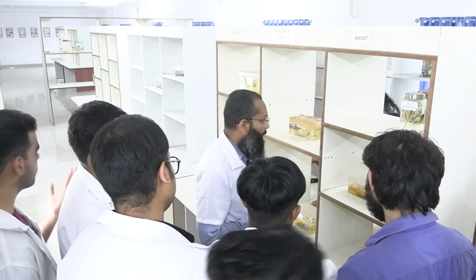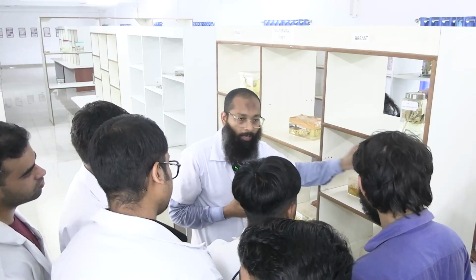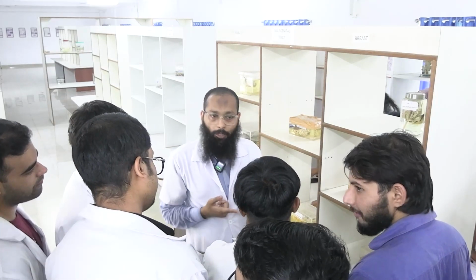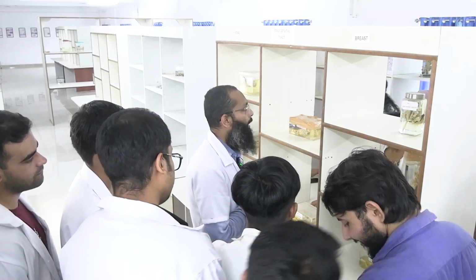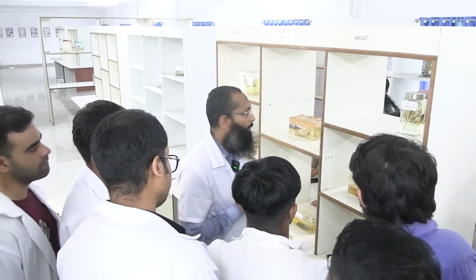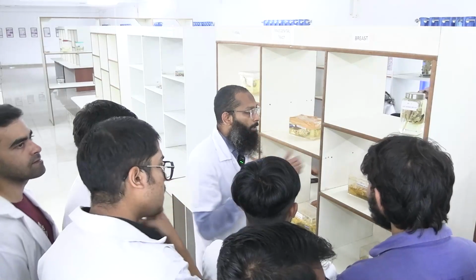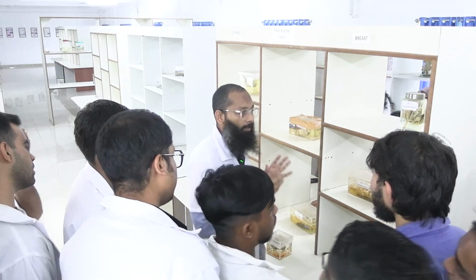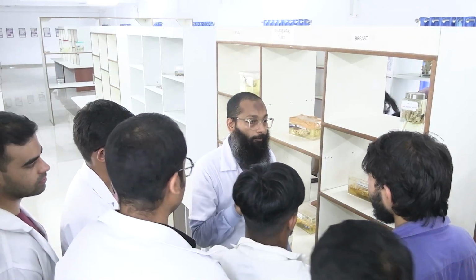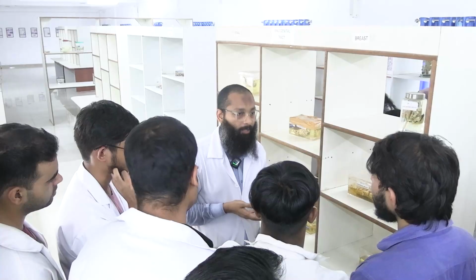So pre-grossing is done, grossing is done, then after taking out the tissue, what do we do? Tissue processing. I told you last time why tissue processing is done. Tell me why we do tissue processing, why we don't send the tissue directly for microtome? Yes, to make the tissue hard enough that it can be cut in thin sections.